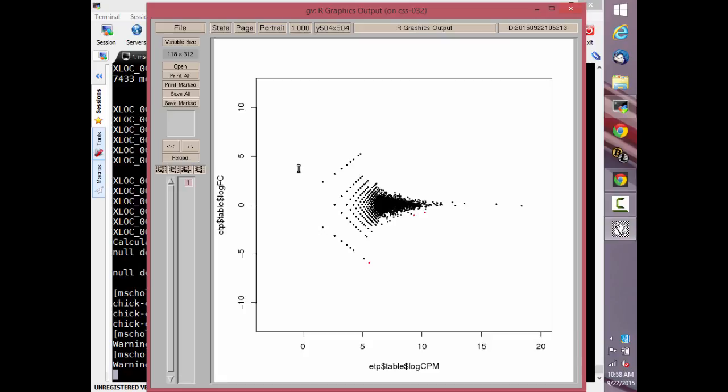Well, it might be, right? If this were real, if you had 50 million reads per sample, and you only got 2 genes, this is usually cause to celebrate, right? I have to do 2 follow-up qPCRs, and then I'm done, and I can publish this paper. It's usually not going to be the case. A lot of this is because of the variation and not enough reads to actually give you good value. So this is based on like the total read count, right?